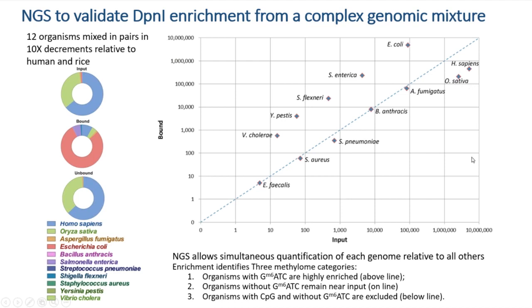So this particular experiment showed us a lot of different things, in particular, that this process is not only sensitive to very low dilutions. Notice the levels that things like Vibrio cholera are spiked into, 5 orders of magnitude lower, but also that it's effective across a broad range of genomes. And even these other microbes are enriched an order of magnitude compared to plants.